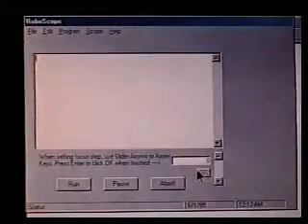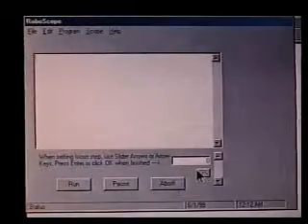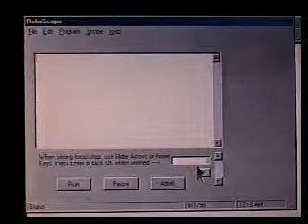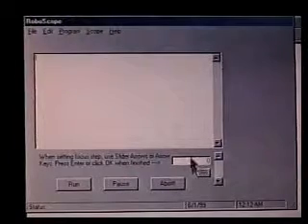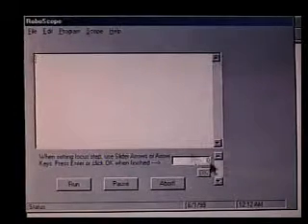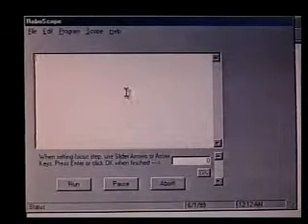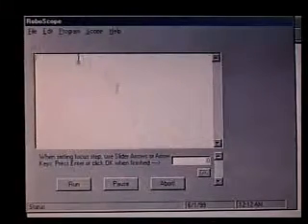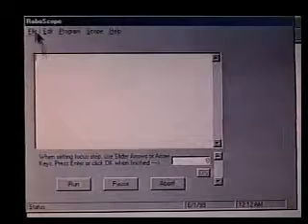And I'll show you how to write a program. Before we start, I'll show you the general layout of the program.